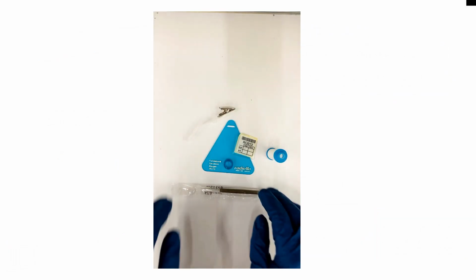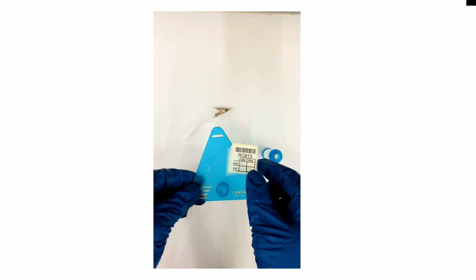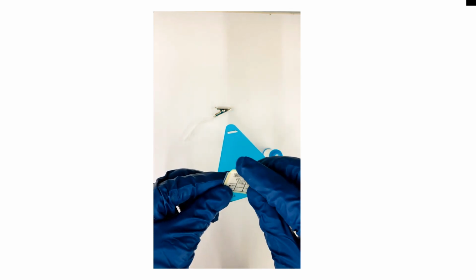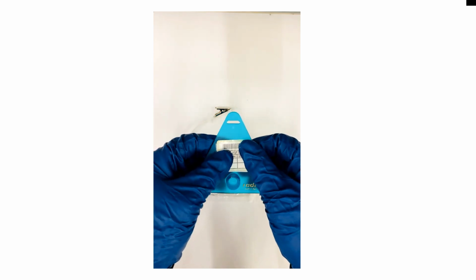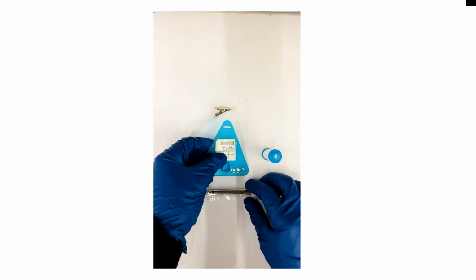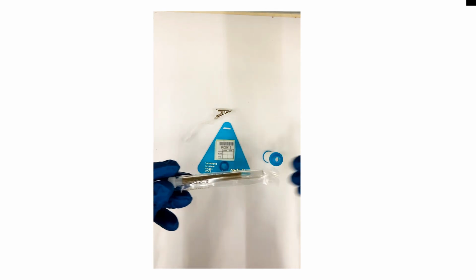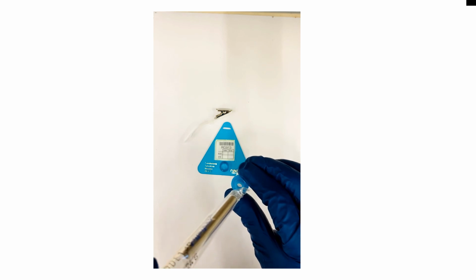This video shows the assembly of the Radiello sampler with its individual components. A barcode label is included, as well as some other accessories not shown here, such as an adapter to orient the diffusive body parallel to the support plate and a protective shelter for outdoor air sampling. The cartridge adsorbent is inserted into a cylindrical diffusive body, which is attached to the support plate by screwing the threaded end as shown.